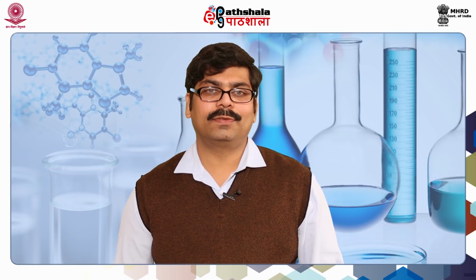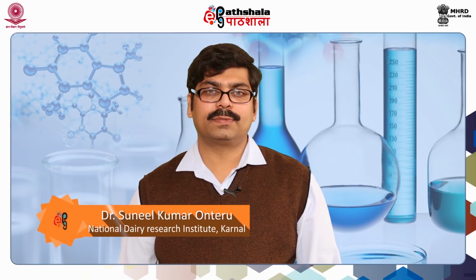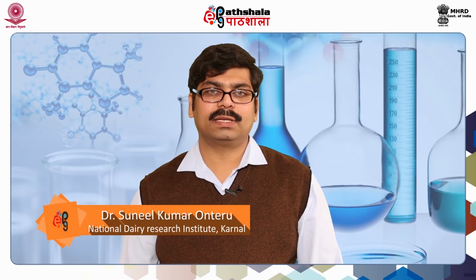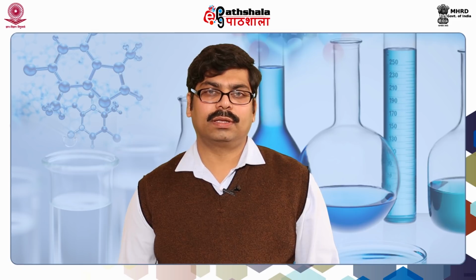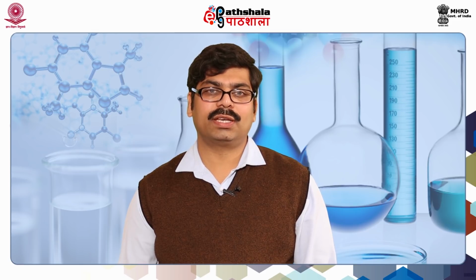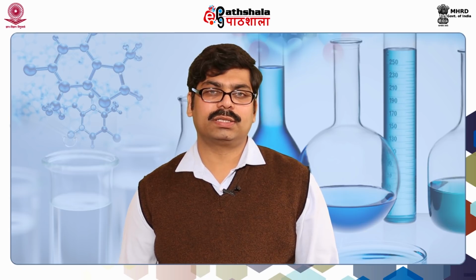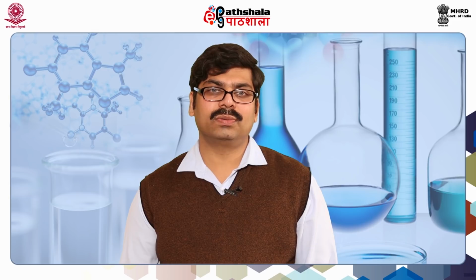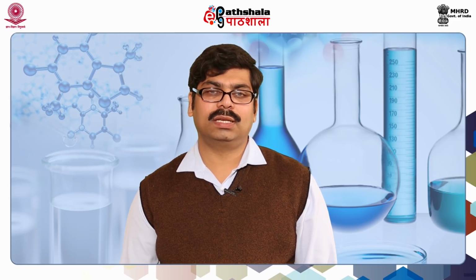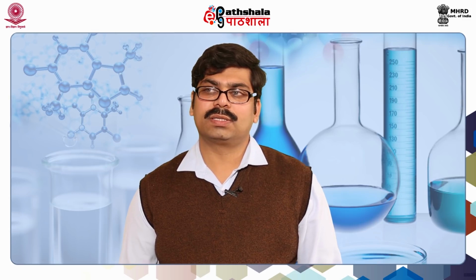Dear students, so far we have discussed the principle of HPLC, instrumentation of HPLC and techniques of HPLC, and in the instrumentation we have discussed the mobile phase, stationary phase columns and pumps, injector and guard column, and finally different detectors and the algorithm that can be used to choose the best detector in HPLC experiments.